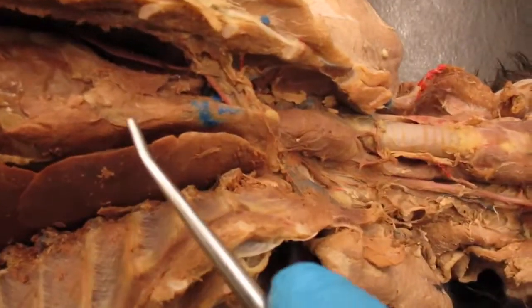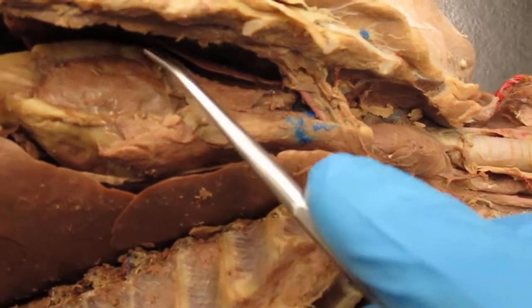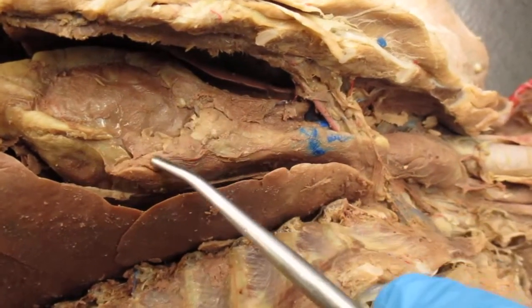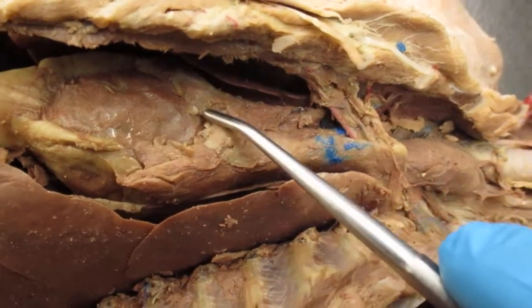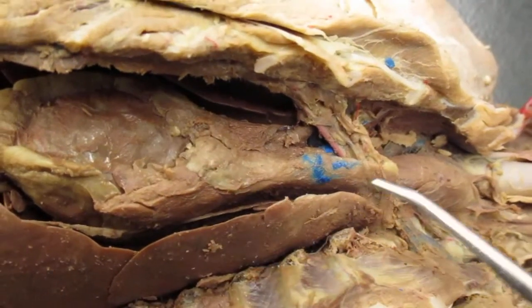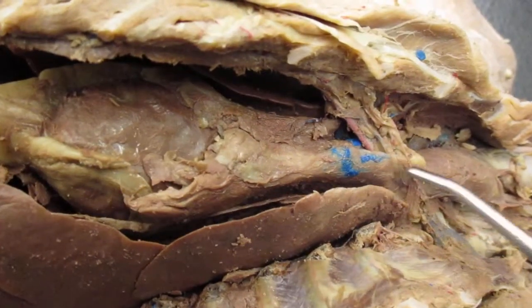And we can see this structure right here. Look at the probe where it's circling. This structure right here is going to be superior as well as anterior to your heart within the mediastinum of your thoracic cavity, that is your thymus. That is your thymus.